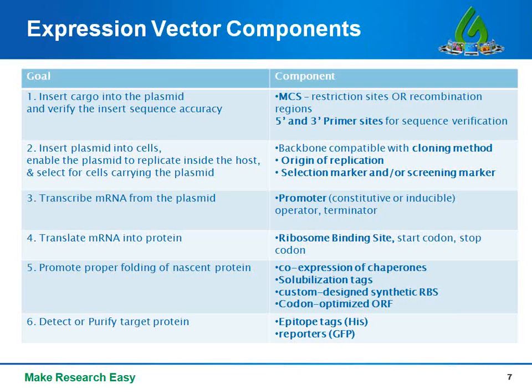And I want to sort of focus on what our goals are and what our workflow is. So we'll go through each of these steps in more detail on following slides, so don't worry about digesting it all at once. So what's the first thing you need an expression vector to do? Well, you need to be able to insert your cargo and then verify that it's been inserted accurately.